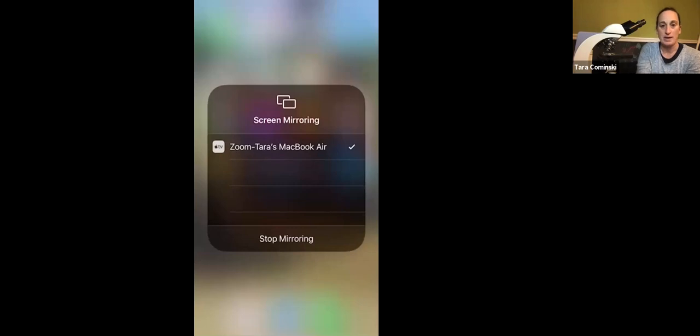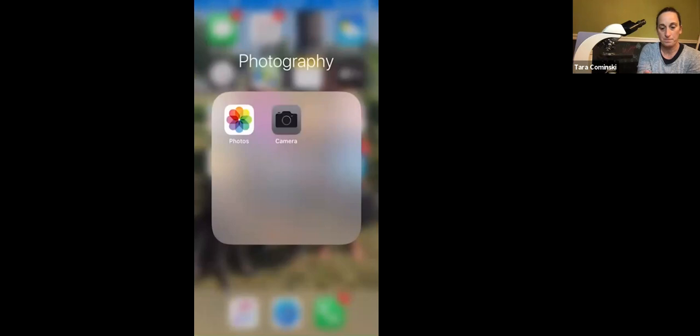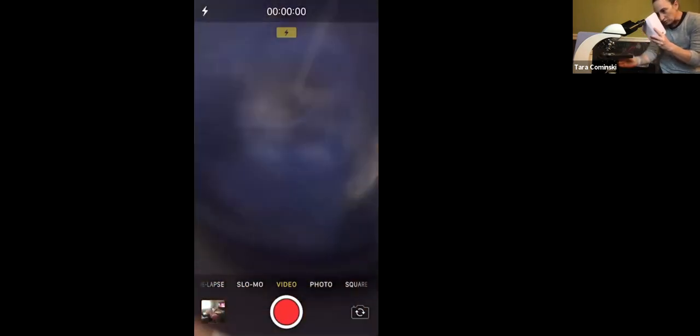Okay, so we're back. Let me now go back to my camera. Back to my video. All right, so remember what I'm going to do. Now I'm manually moving it to the right, and you're going to tell me which way it moves in the microscope. So let's see if I have a steady enough hand to do this. Most likely not. All right, so I'm moving it to the right. Ready? Here we go. I'm moving it to the right. Which way is the E moving?